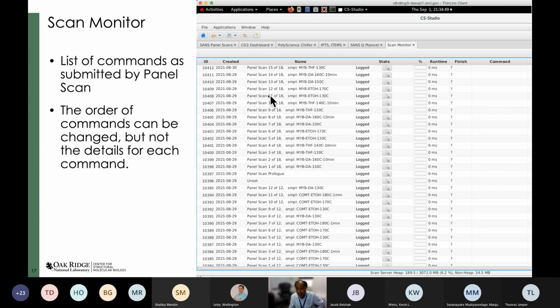Because each row is a collection of commands, you can skip to the next command within that macro, or you can abort the whole macro. Usually, I recommend users to just skip to the next command. Aborting it fully would mean it may not finish safely to get to the next step.